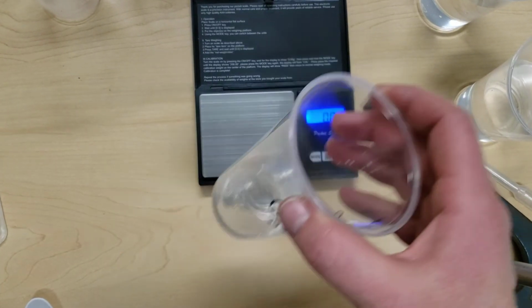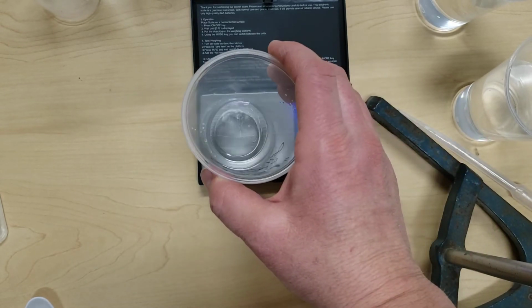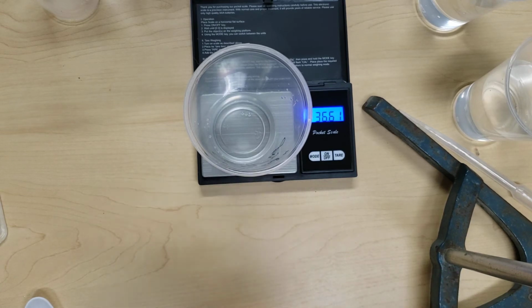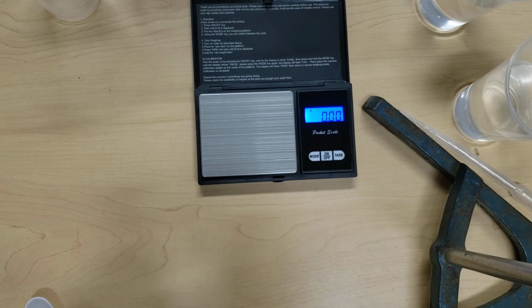Once it has completely filtered, you're going to want to weigh this liquid that has come through the filter paper and record that amount on your report form. We're also going to pour 8 to 10 milliliters of our salt solution into our graduated cylinder and record the exact volume and the weight.